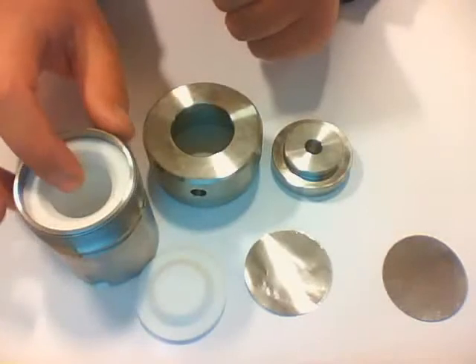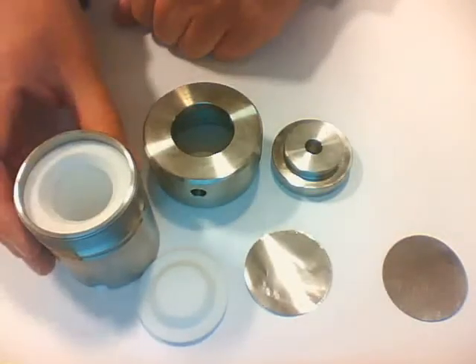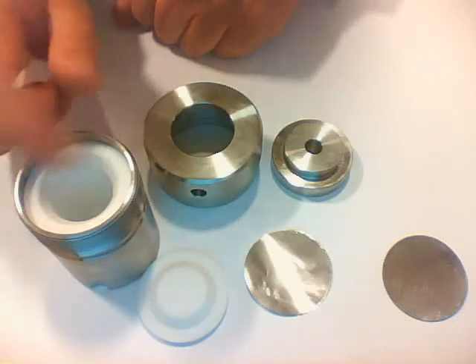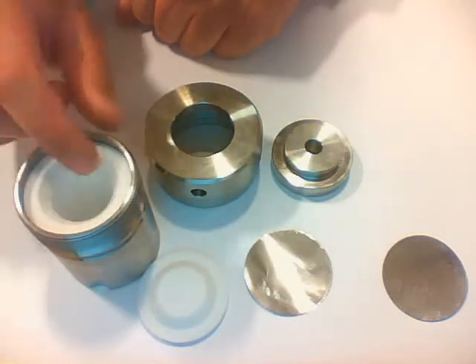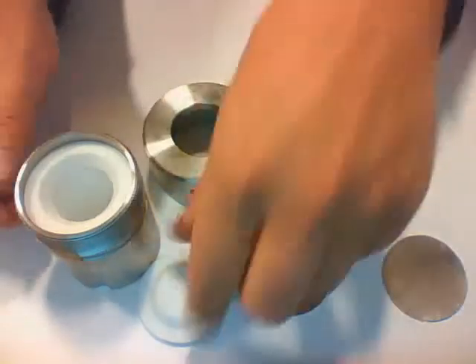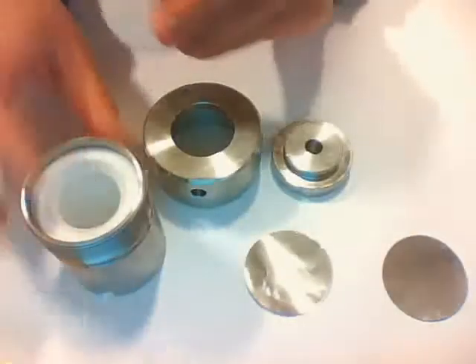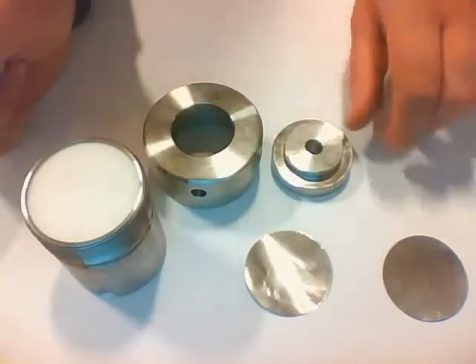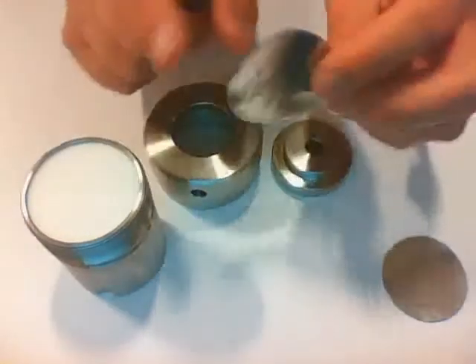Now you can add your sample inside here. You have to make sure that you never fill the body more than halfway — so you can only fill it 50% of the volume of the teflon. When you put in your sample, you can put on the lid, and then you have to take the corrosion foil.